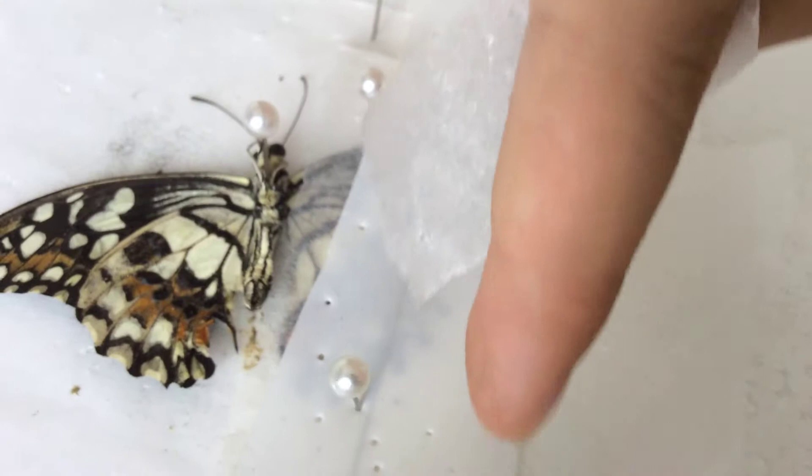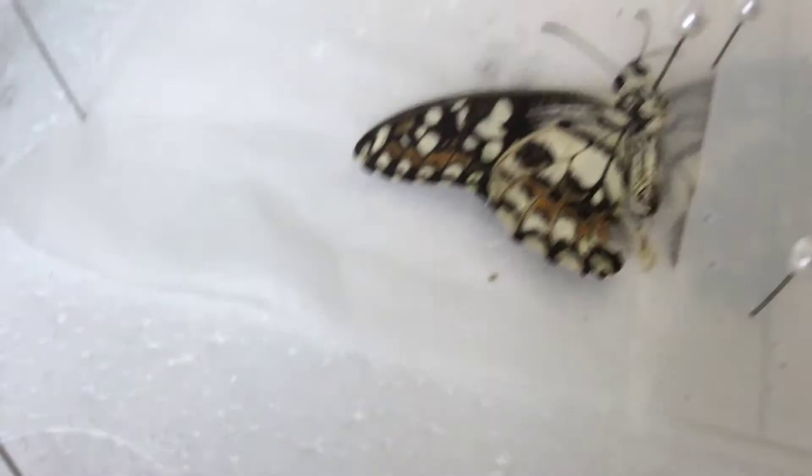Now, this wing — the one that you're right now staring at, the one that we're right now pointing at — is not deformed. So that is a normal wing. We're going to now mount the deformed wing, and you're going to see, and we're going to do the exact same thing for the normal wing.